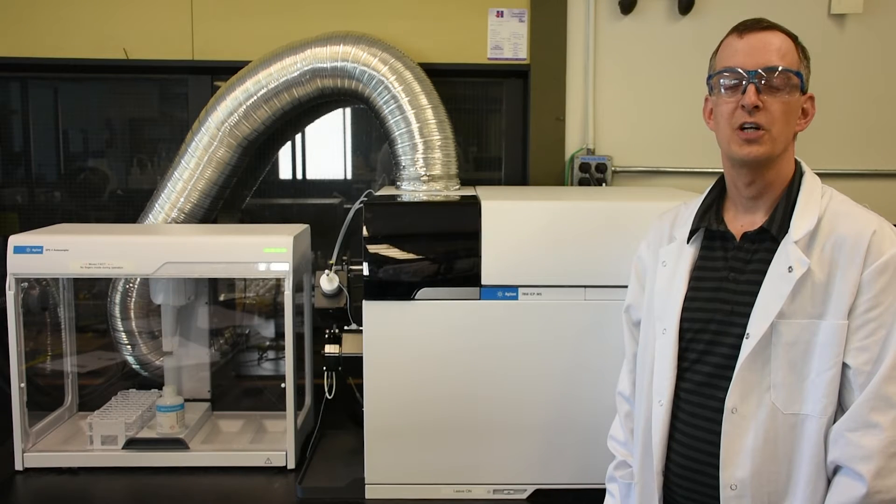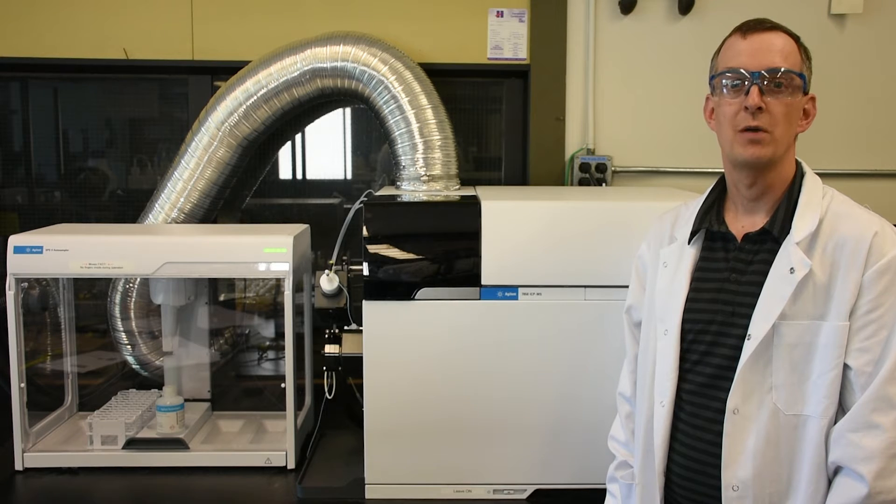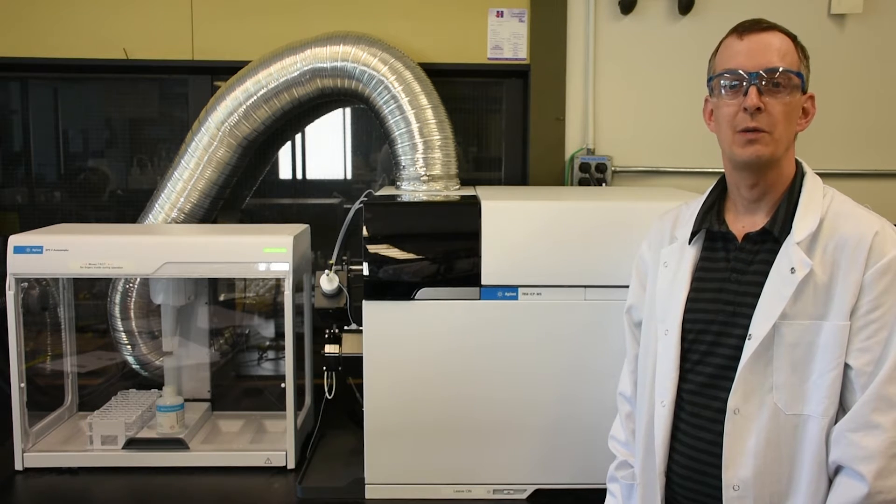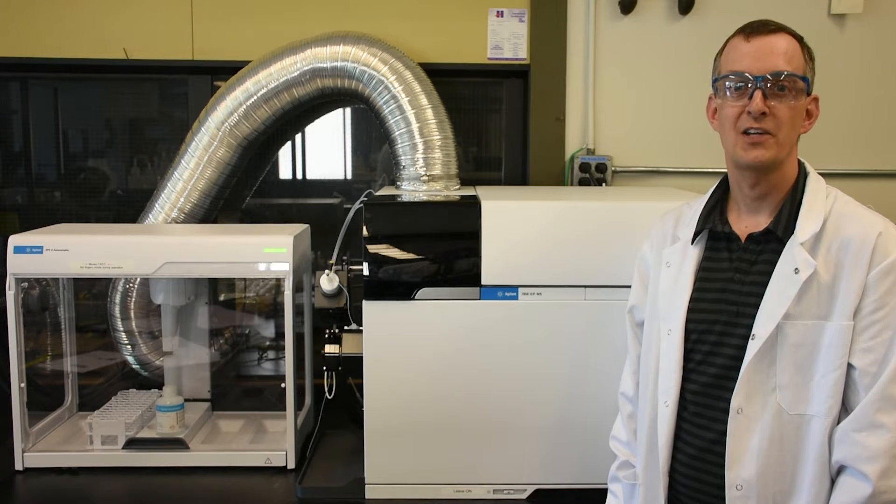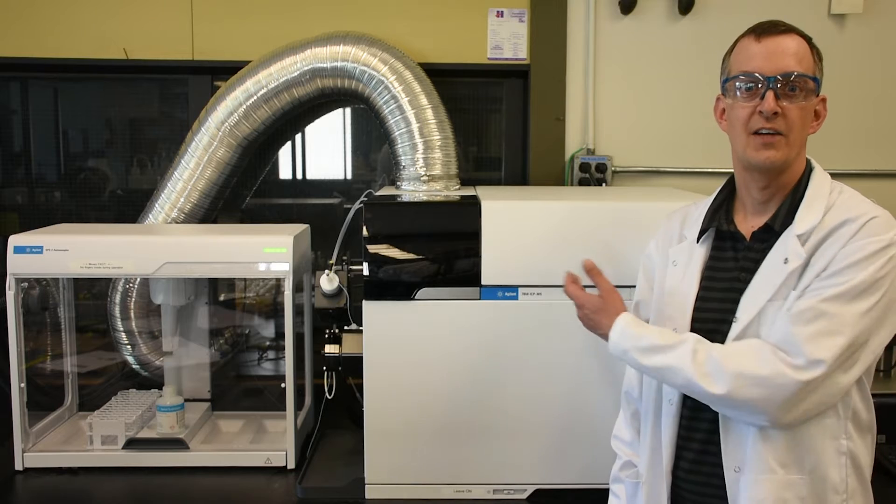Hello and welcome to this series of instructional videos for the third-year Analytical Chem Labs. I'm Dr. Robin Studley, and this video will be about the instrumental setup for inductively coupled plasma mass spectrometry, or ICP-MS.